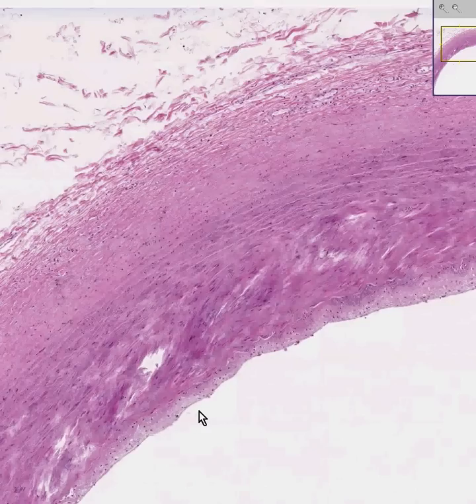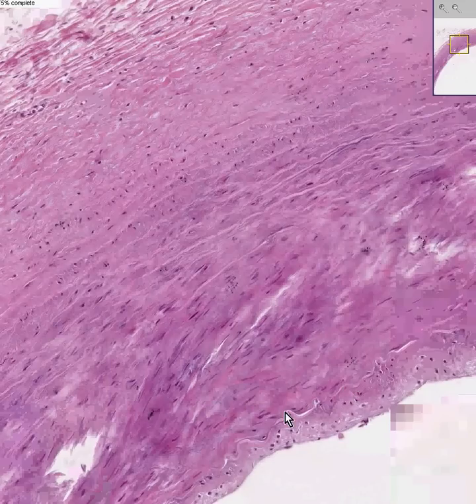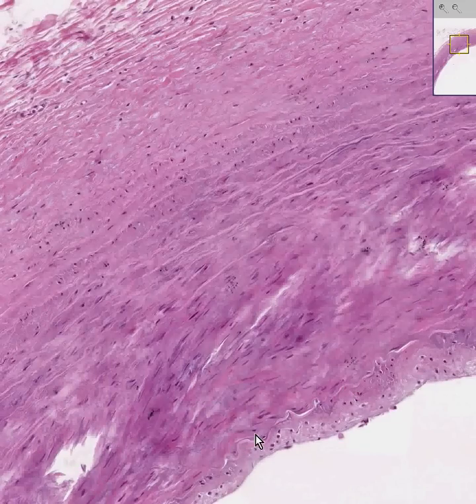An artery, no matter what size it is, will always have a fairly thick rigid wall. It will have a squiggly internal elastic lamina like we saw in the slide of the aorta. It will have a squiggly internal elastic lamina like we can see here. See this wavy little light thing? That's an internal elastic lamina.